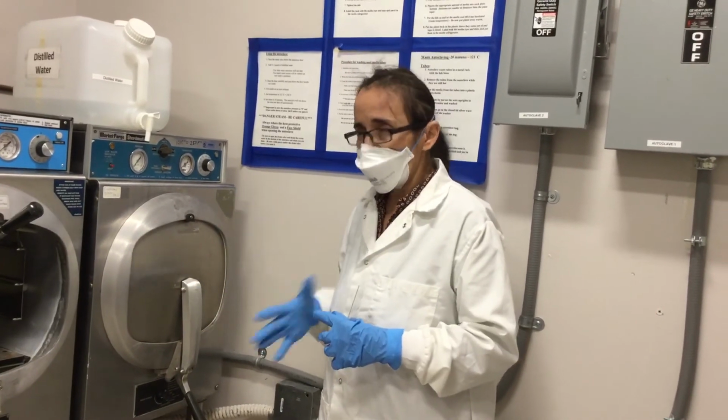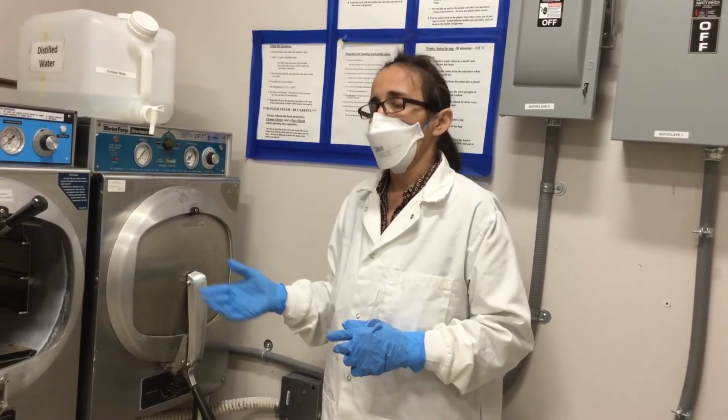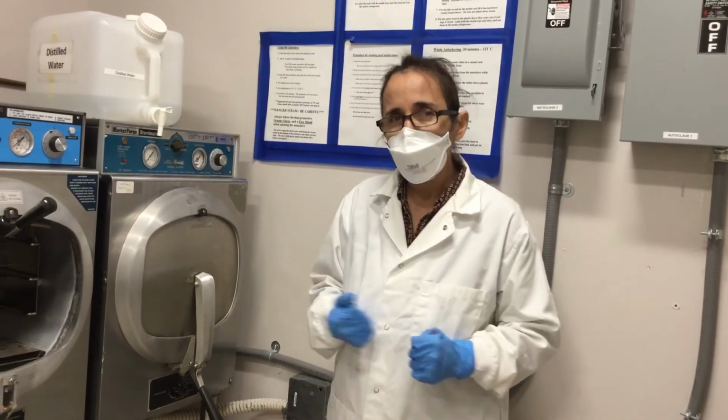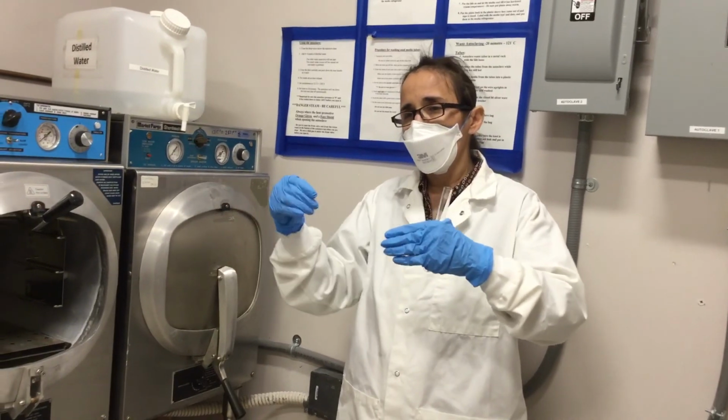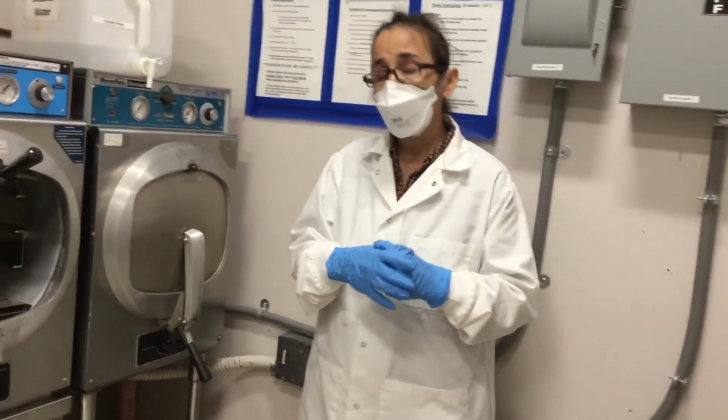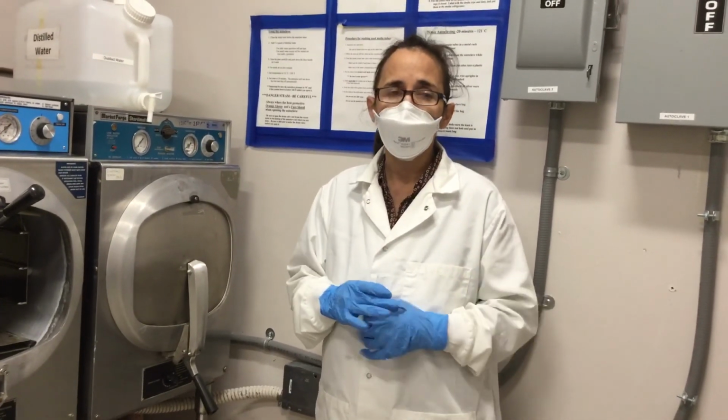Once this is running, because this is the demonstration, and once it's finished, I will make another video where I show you the end result, and I will show you how to put them into these tube holders to make the slants, and then I will be done.